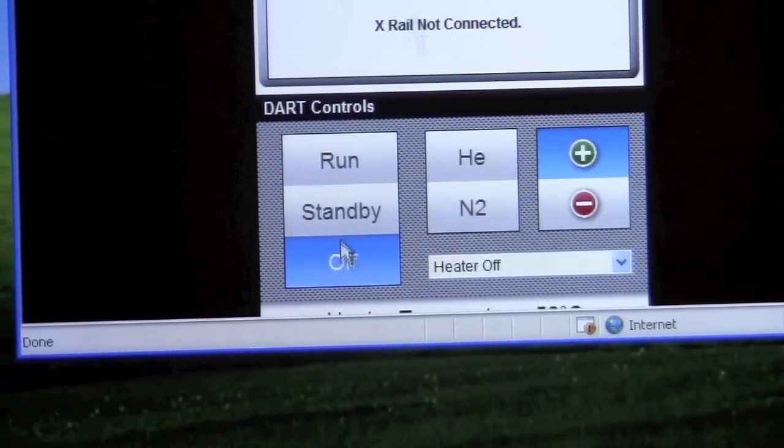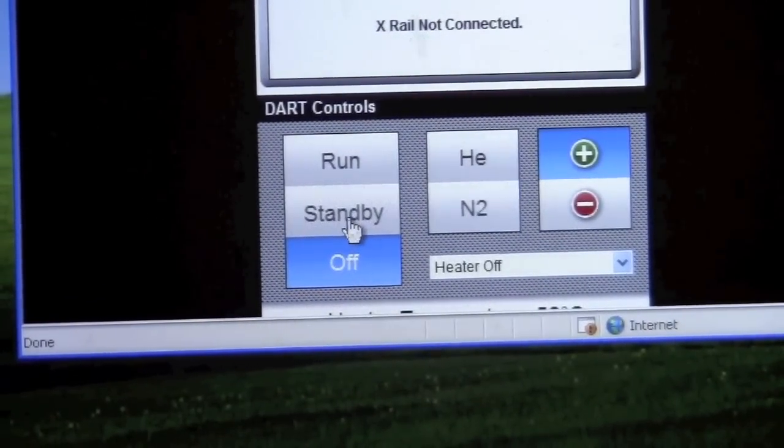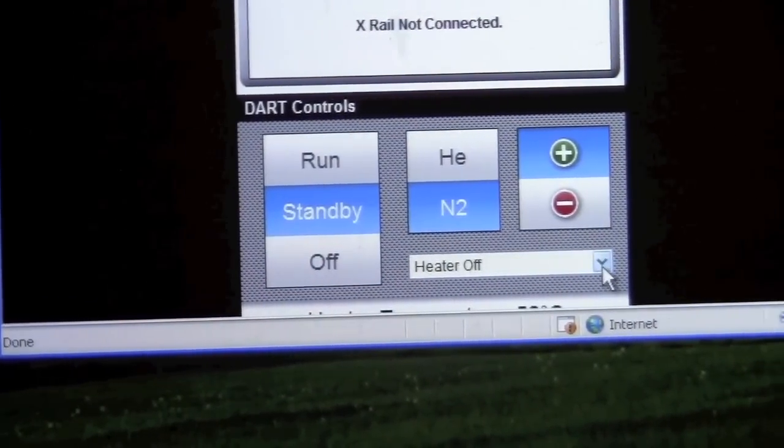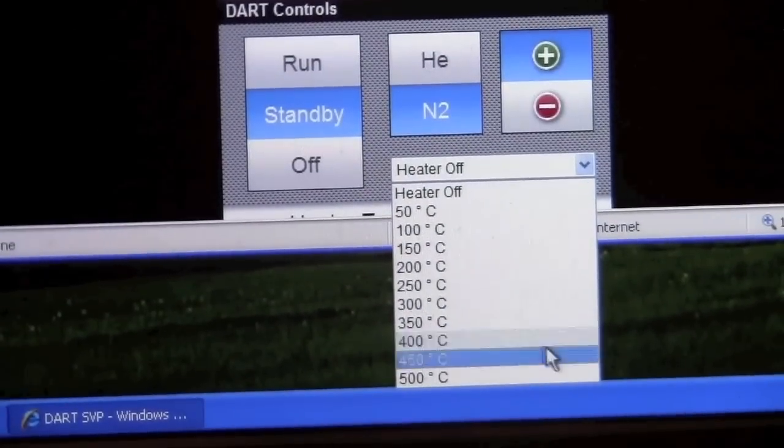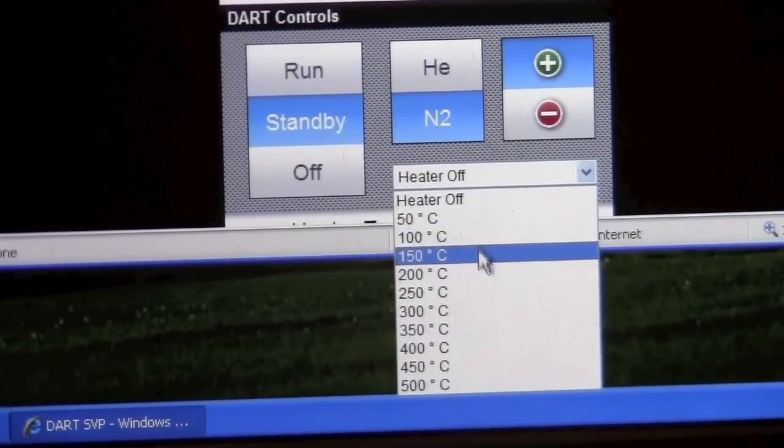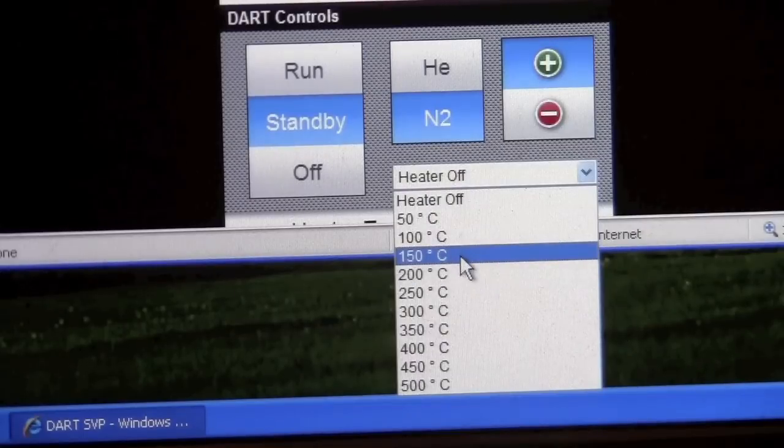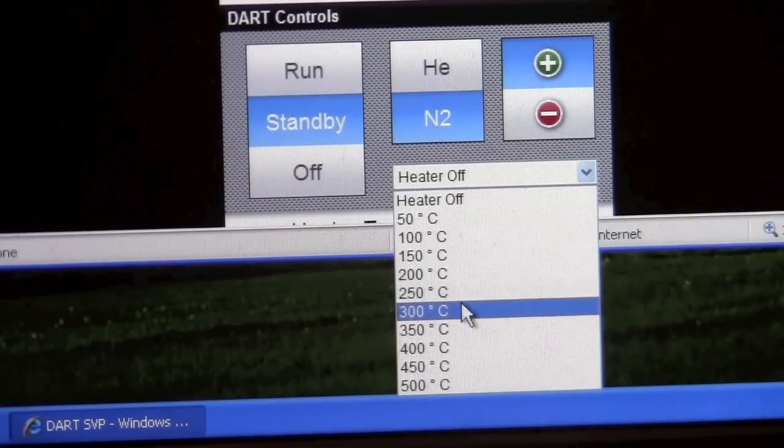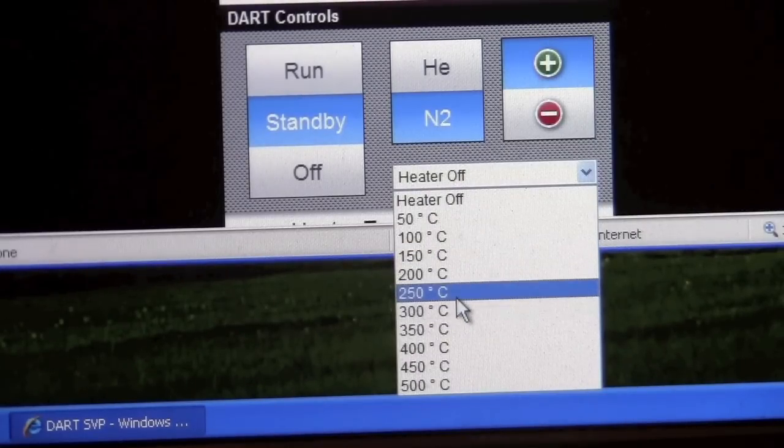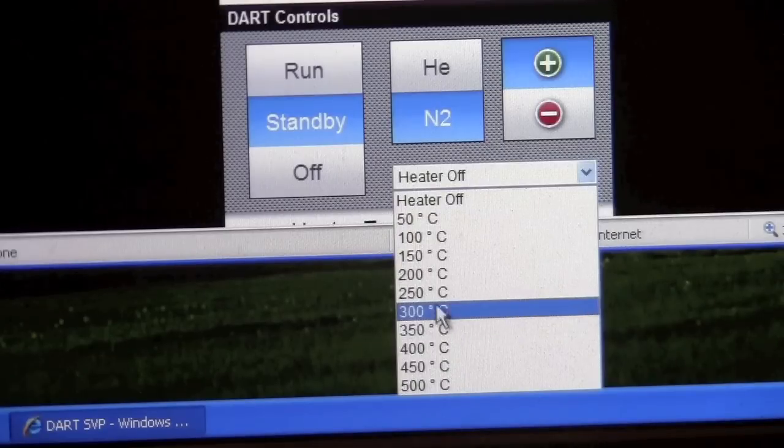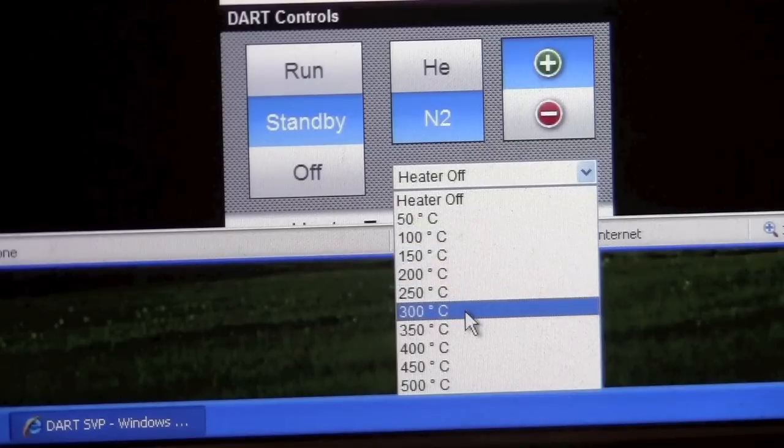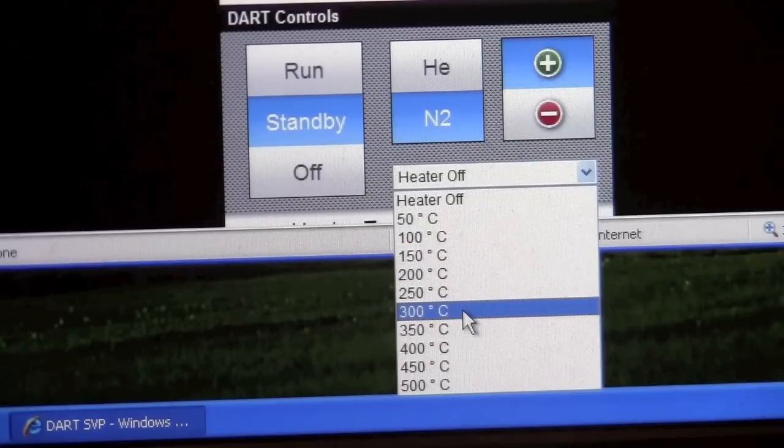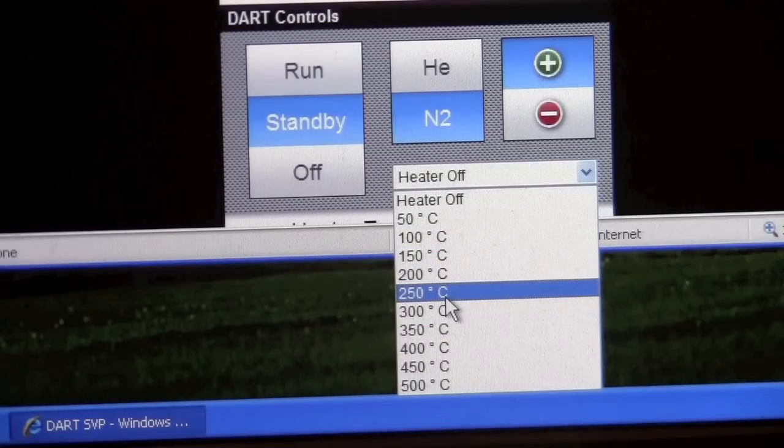The first step would be to put it on standby and then to turn the heater on to an appropriate temperature. Colder is better for more fragile molecules. Higher may give you more signal but at some point it will start to damage your molecule. Typically somewhere between 100 and 300 degrees C seems to be normal. I'm going to set it to 250.